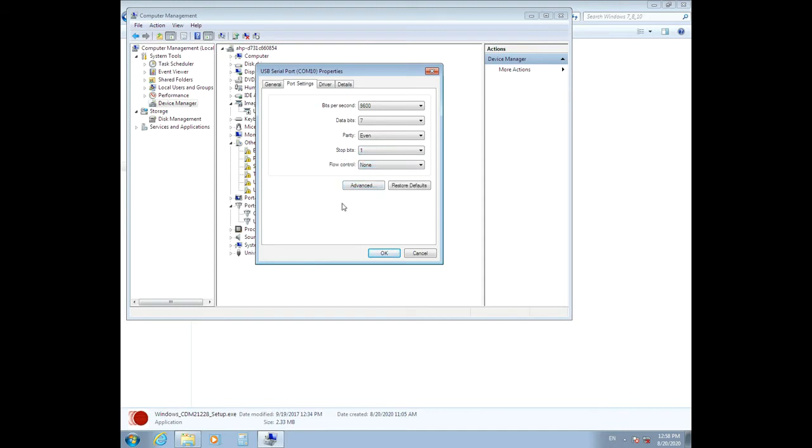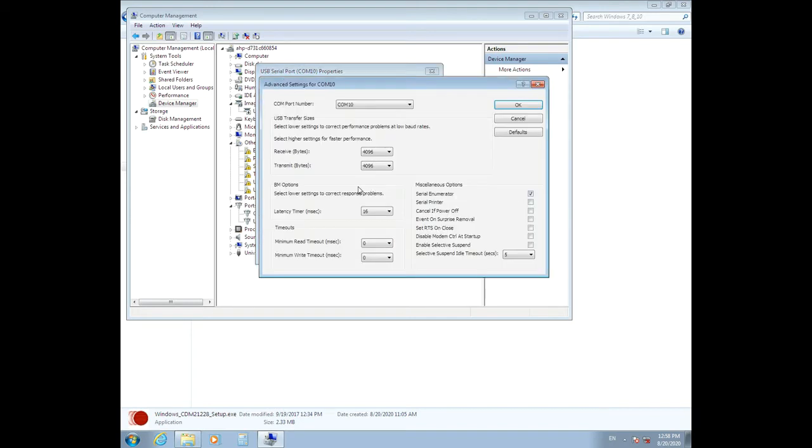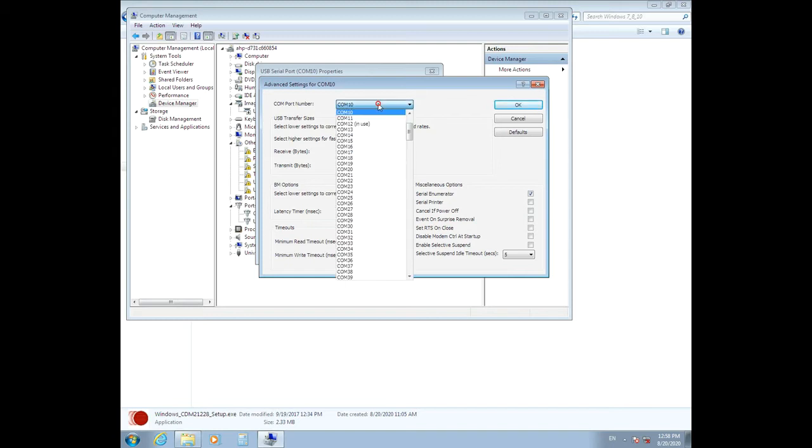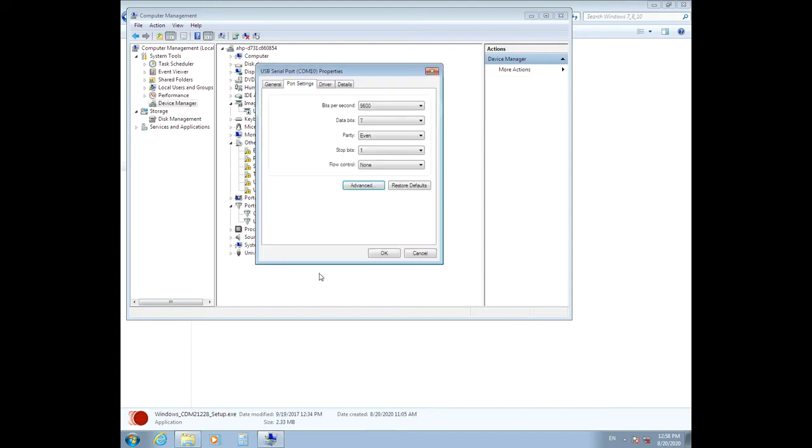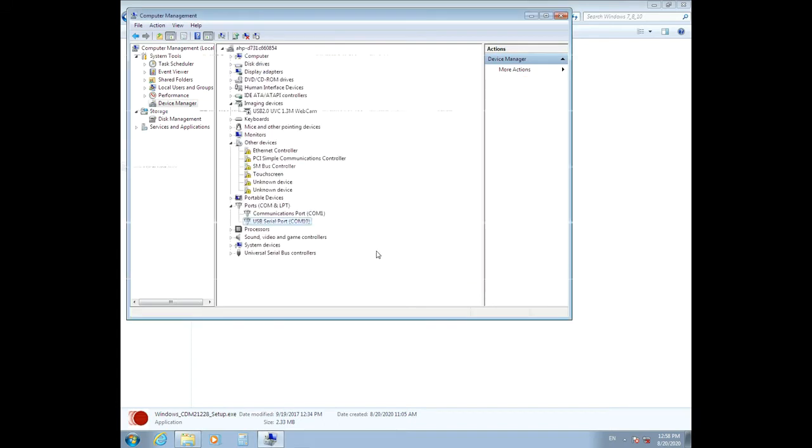Then click on the Advanced button and change the COM port number to COM10. Click OK, OK again.